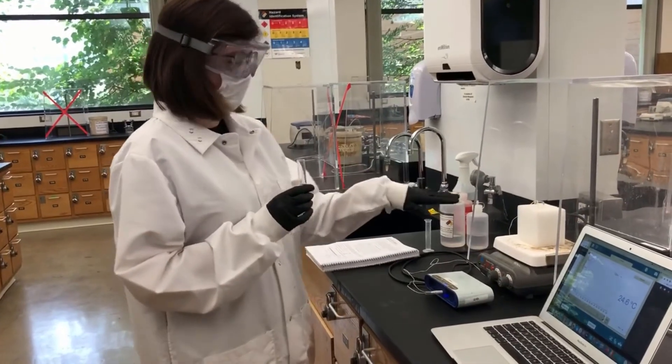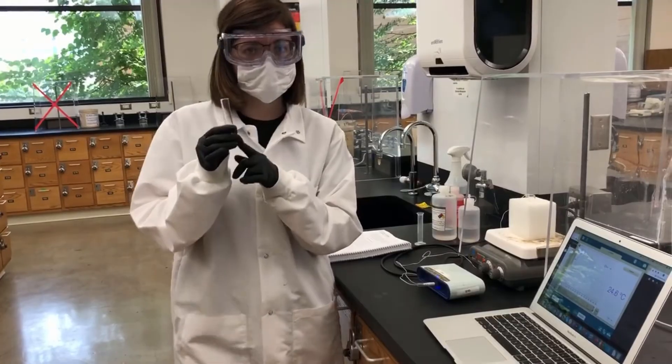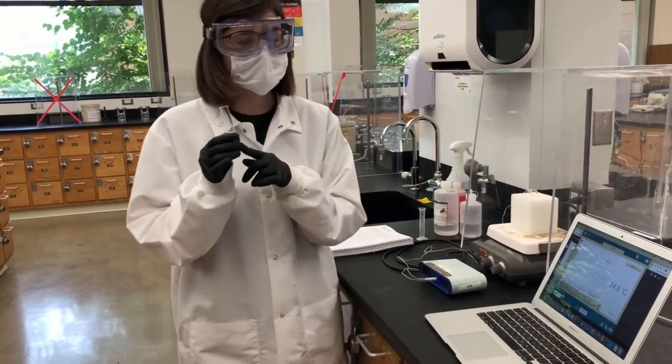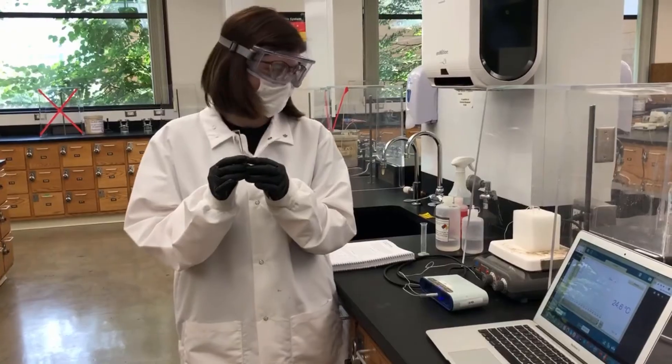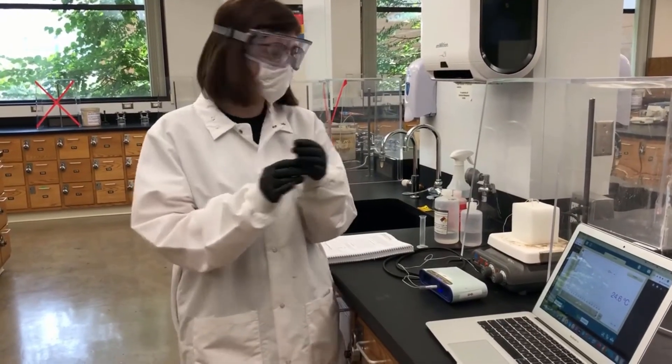We started out with 2.5 milliliters of the unknown in here and we're going to add 7.5 milliliters of the bleach because this is one of the ideal stoichiometric ratios. And then we'll just push start and see how much temperature changes.